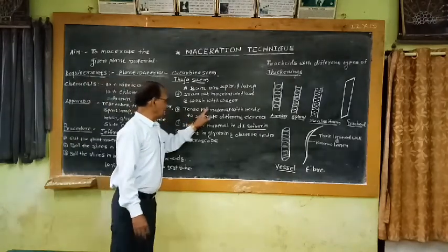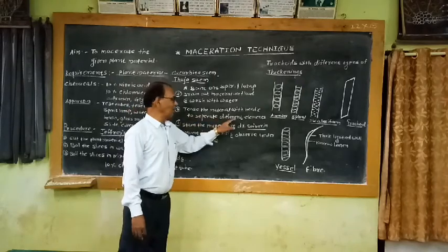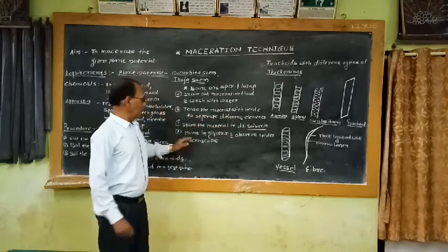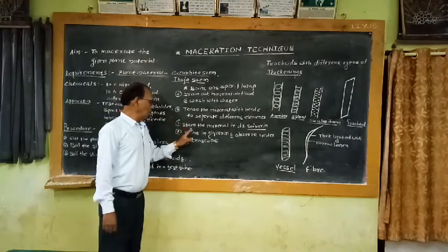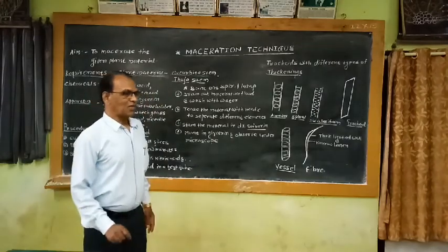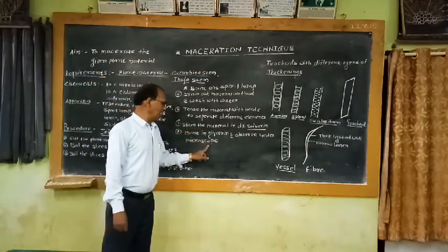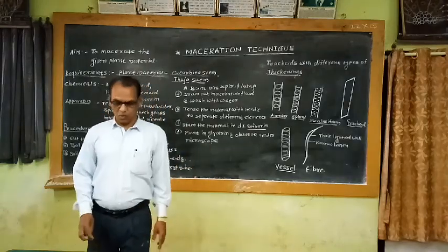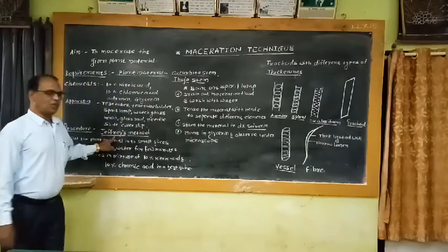Take the material onto a clean slide and tease the material with the help of needles lengthwise in order to separate the different elements. Then stain the material in aqueous safranin. After staining, mount the material in glycerin and observe under the microscope. This is a very simple technique as per Jeffrey's method.